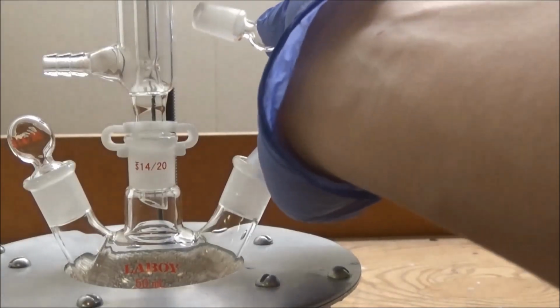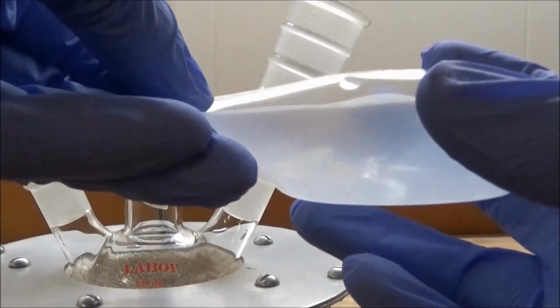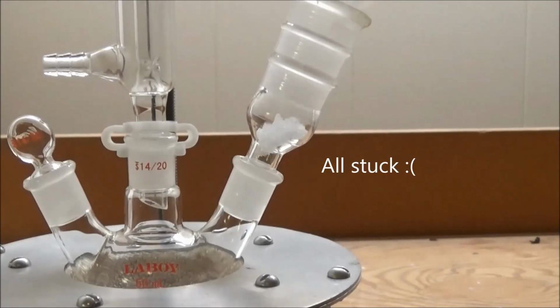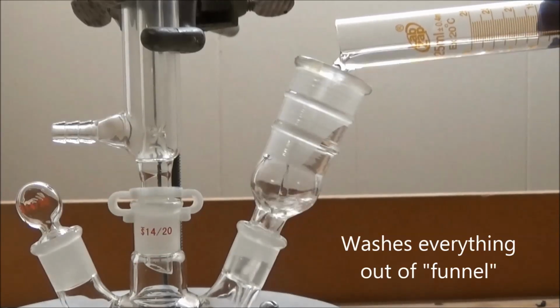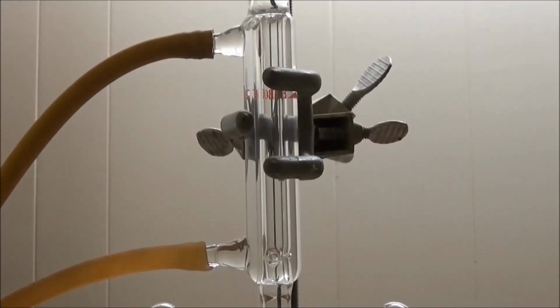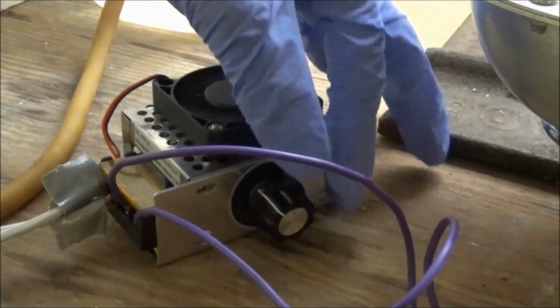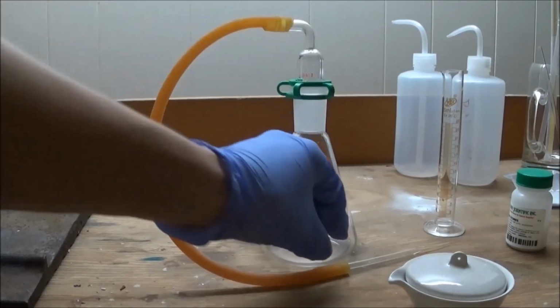First, I added the benzophenone, which took a little bit of force because of the small neck. This was followed by the ethanol. Next, I turned on water to the condenser and heat to the heating mantle, and I waited for the mixture to boil. In the meantime, I set up a carbon dioxide generator.